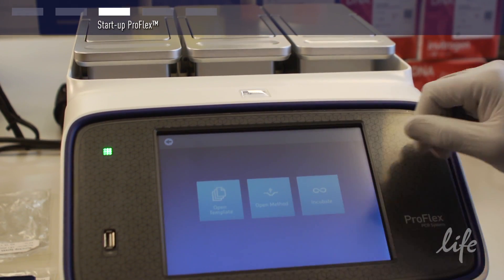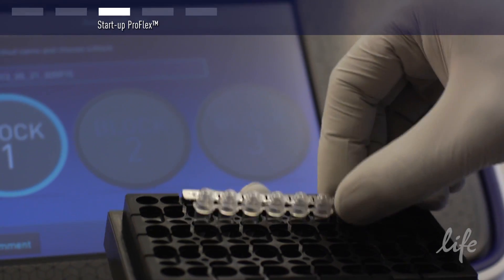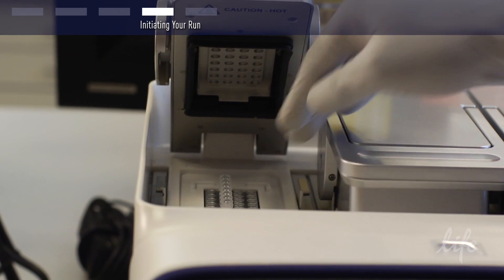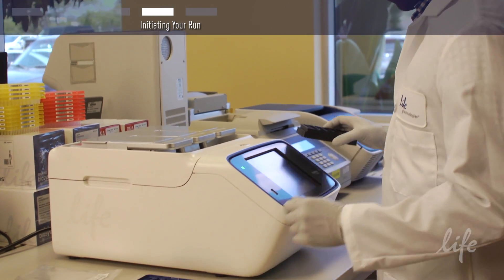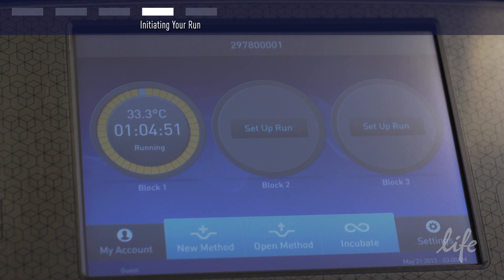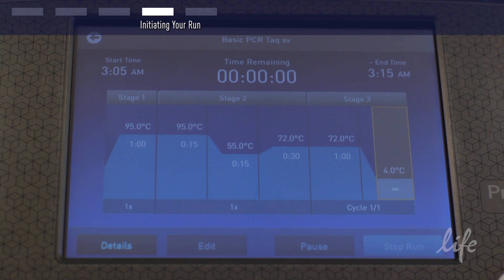Select your block for your run by tapping it and then select from preloaded programs. Prepare your samples and load into your block. Press the start program button and your run will begin. You can monitor your run as it is cycling. When your run is complete, you can choose to end it or set it to incubate.